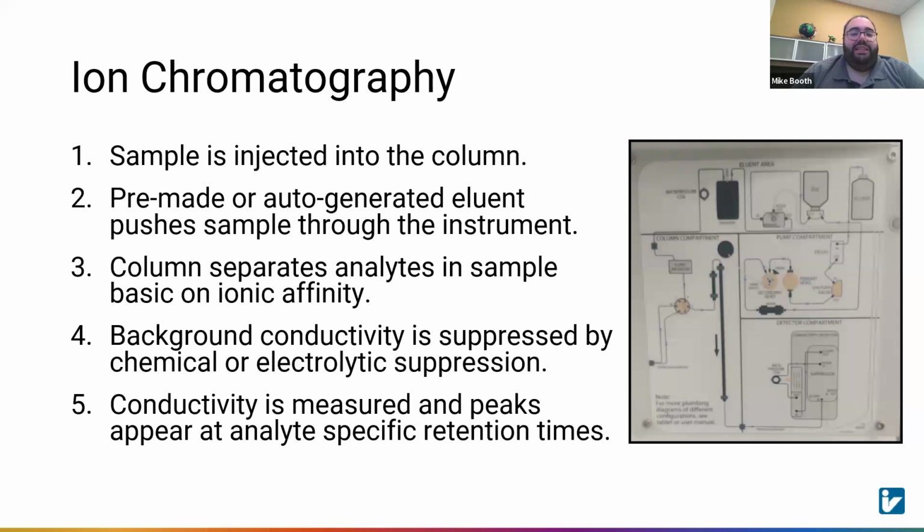And then finally, as I mentioned, the conductivity detector reads conductivity, and you'll start to see peaks appearing at different retention times. How long analytes held on to the column will determine their retention time, and you'll see that through a conductivity measurement. Now, not all IC instruments rely on just a conductivity detector. There are different detectors that you can get, and some applications rely on a different detector.